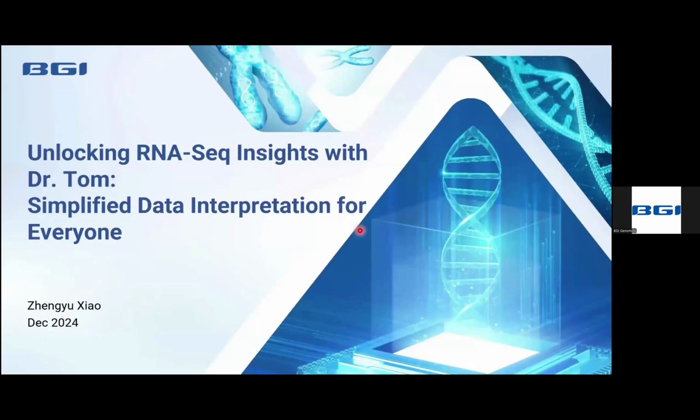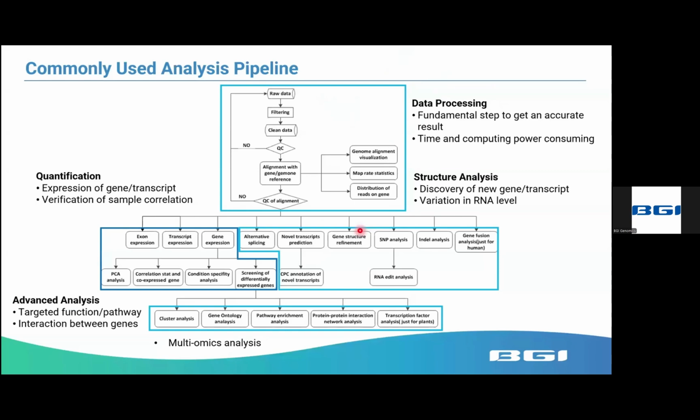Okay, thanks for Yao's introduction. And now we know that RNA-seq is widely applied in almost any research investigating biological mechanisms. Thus, the analysis of RNA-seq data becomes a huge need. And since RNA-seq technology has been developed for a long time, there are mature pipelines to analyze the data. Basically, it can be divided into 4 modules.